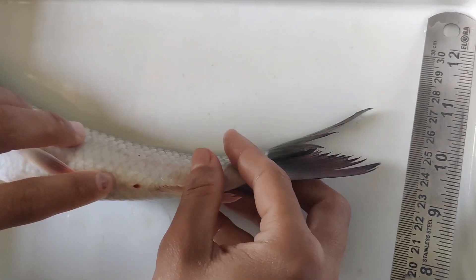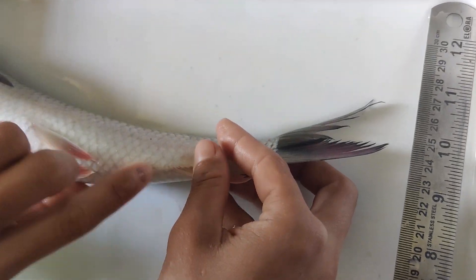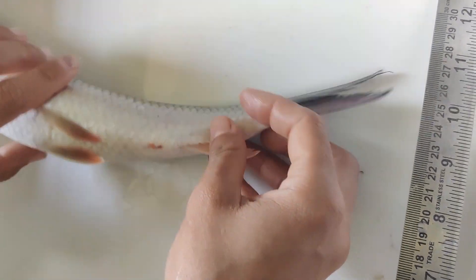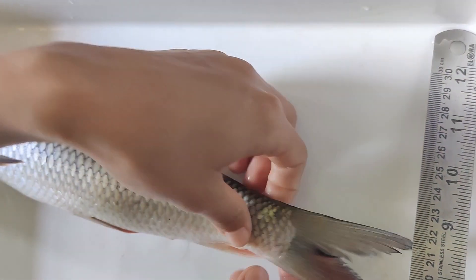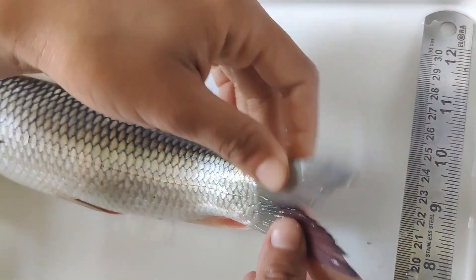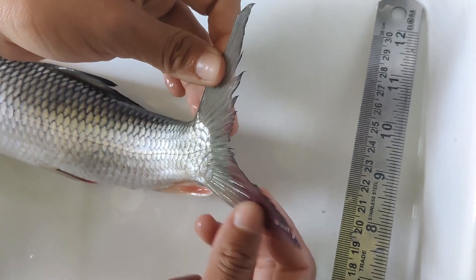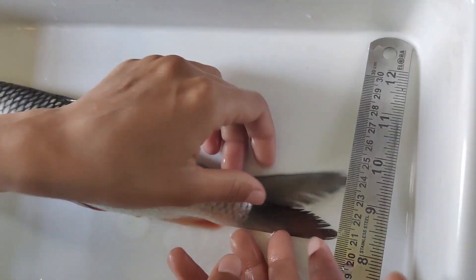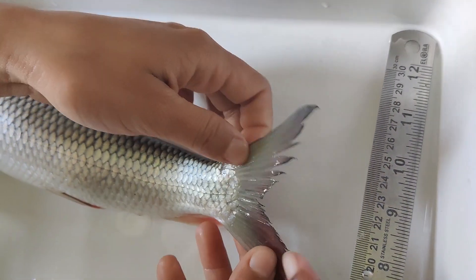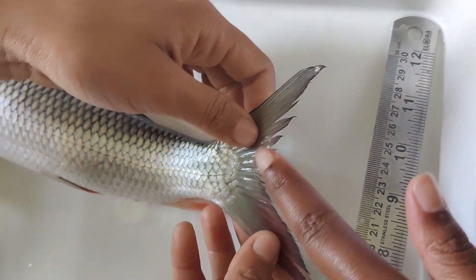There is external waste material — excretory — which is spread out. This is what we have called the caudal fin, and the caudal fin is bifurcated.